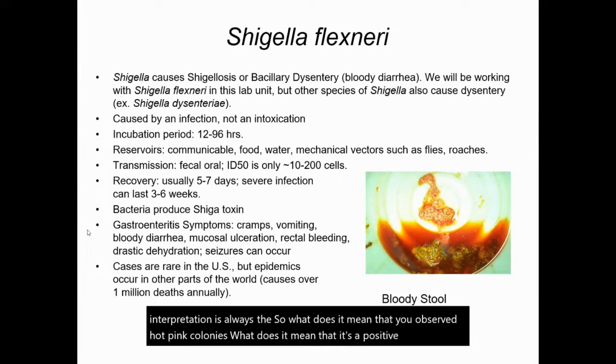So with your interpretations, you're always going to go back and look at the purpose of the media. Why did we streak our organism on a MacConkey plate? What are we hoping to learn about the organism? Okay, so that's going to always go back to what your interpretation is.